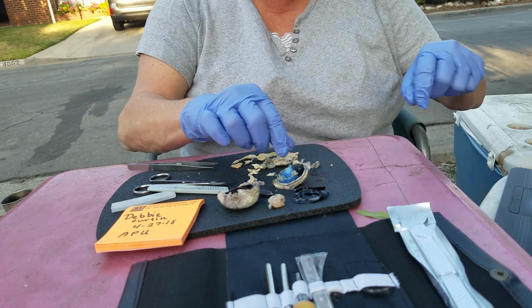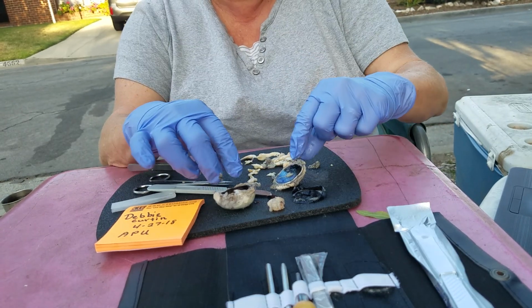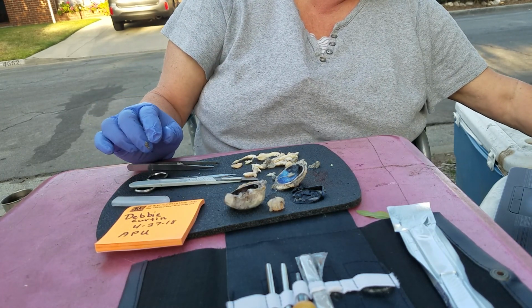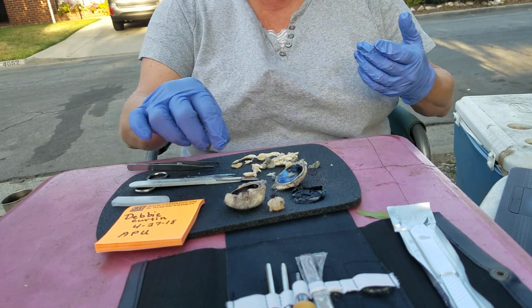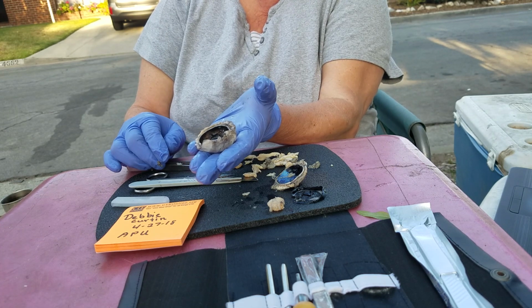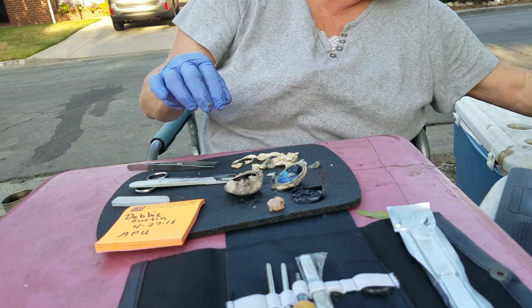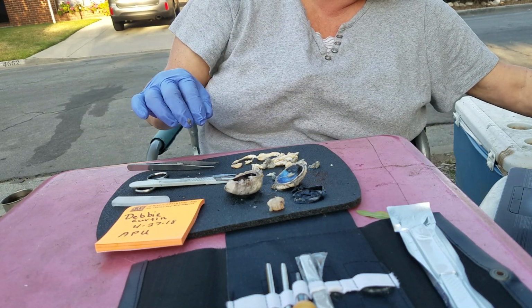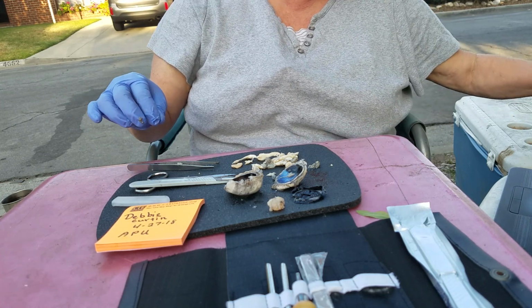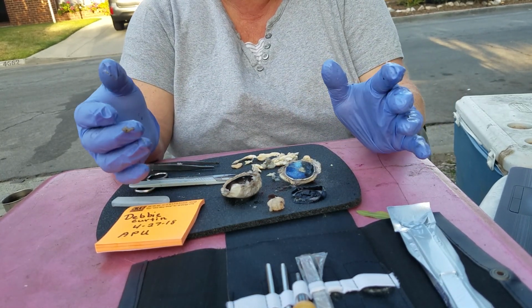And we'll see if we can get a picture of the sclera. The lens. That helped. That'll be inserted into data table 4. And that concludes our dissection of the cow's eye.